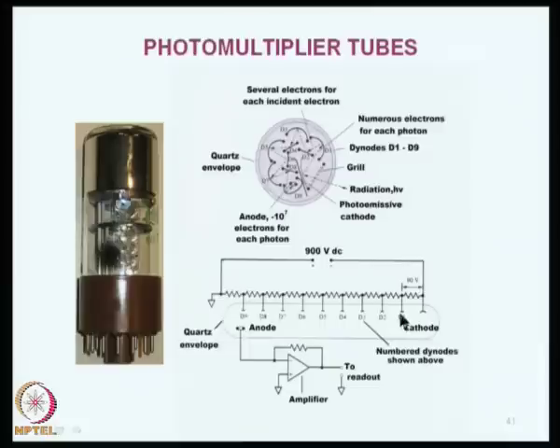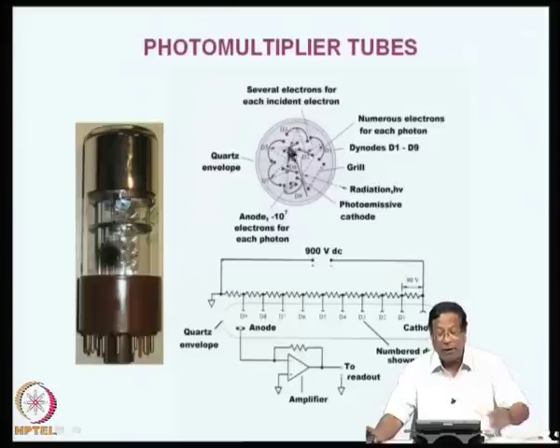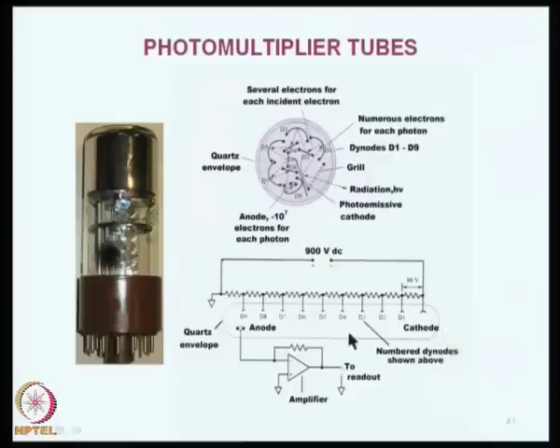These are the dynodes D1, D2, D3, D4, etcetera. Each dynode is maintained at a higher potential than the previous one. So, it varies up to 900 volts DC, and the cathode is here and the anode is here. Numbered dynodes are shown above here, and they are all connected in the electronic circuit, so the current can be amplified and taken to read out. This is how a photomultiplier tube looks, and you can see the dynodes here 1, 2, 3, 4, 5, 6 like that, and each dynode releases more electrons than the previous one. So, the electrons will keep on increasing, that means the current also will be increasing.